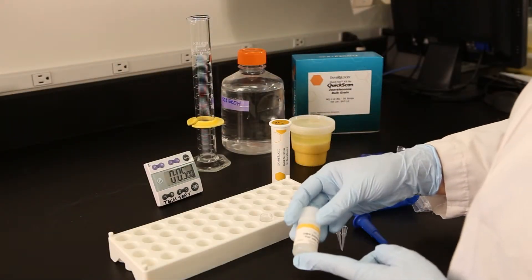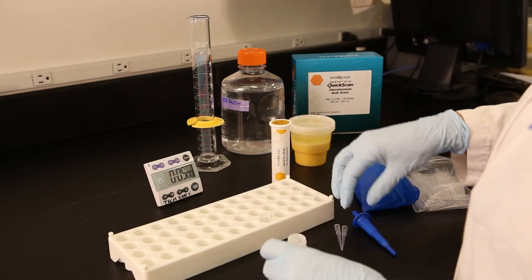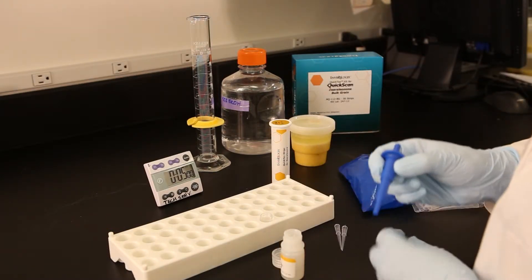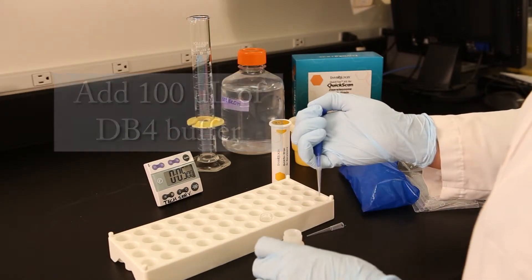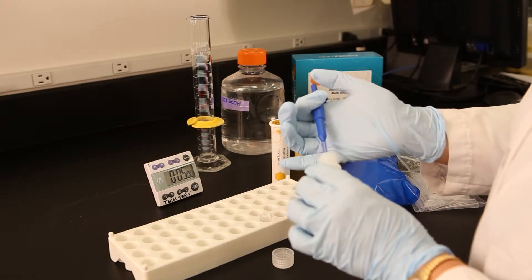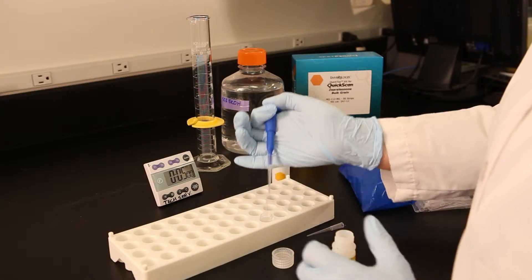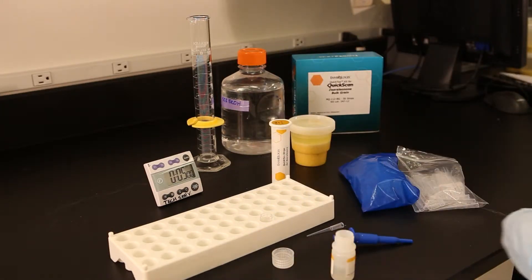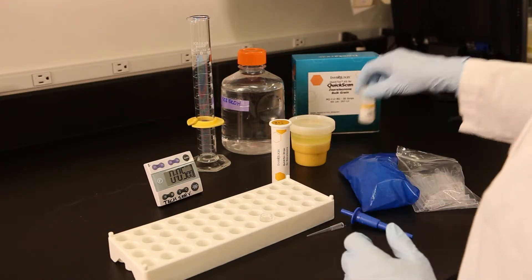Set aside two pipette tips and one reaction vial. Using a calibrated pipette and a fresh pipette tip, place 100 microliters of the DB4 buffer into the reaction vial. Be careful not to contaminate the DB4 buffer, and use a fresh pipette tip for each new test. Cap the buffer bottle tightly when not in use. Discard the pipette tip after this step.